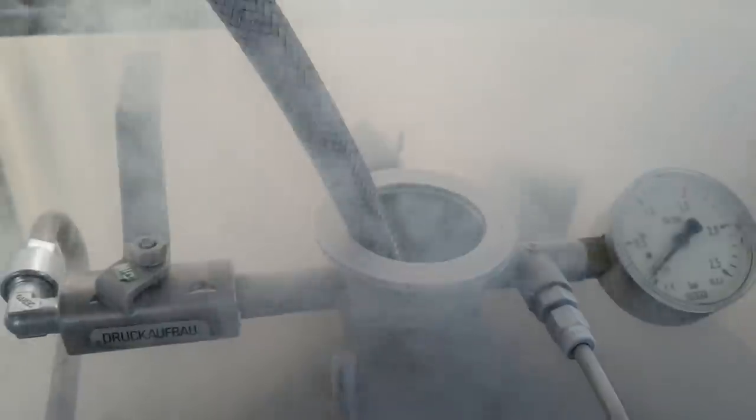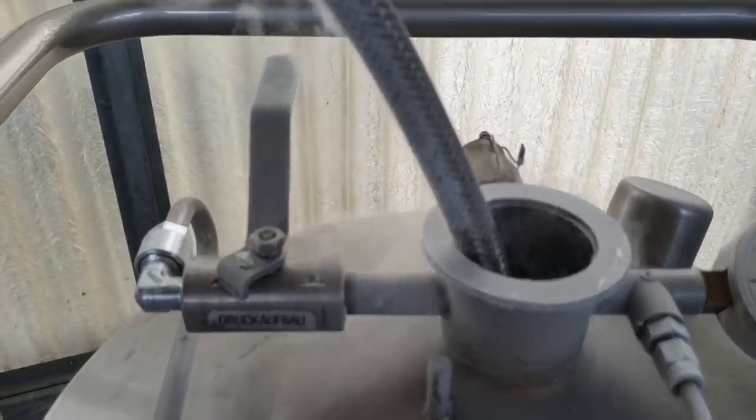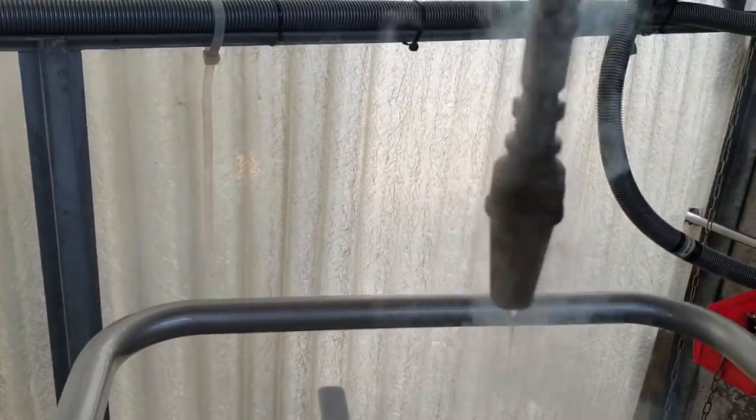At that point we're basically done. You can see it all spilling out of the top, so he's full. I'm going to close off the valve. And that's it — he's now got about 200 litres of liquid nitrogen in there.